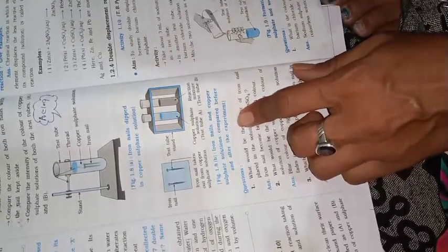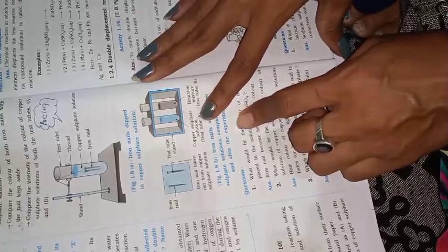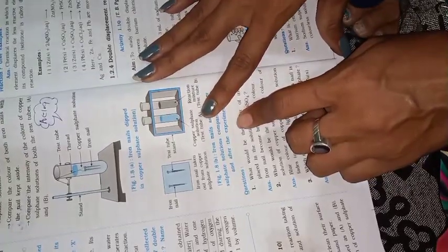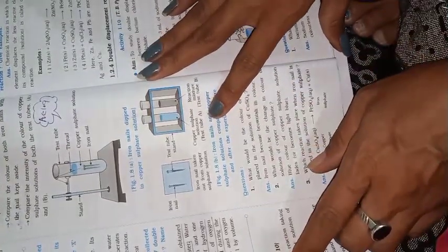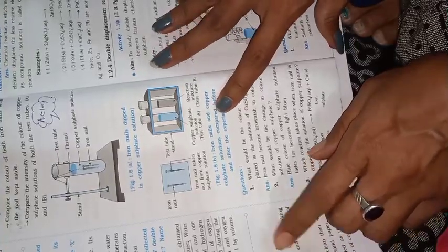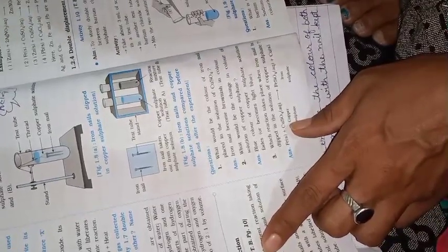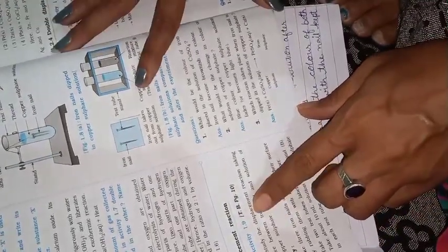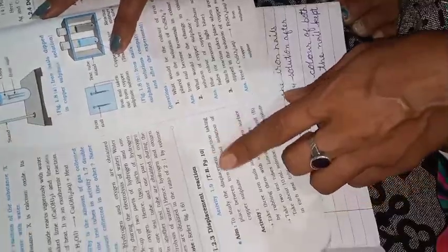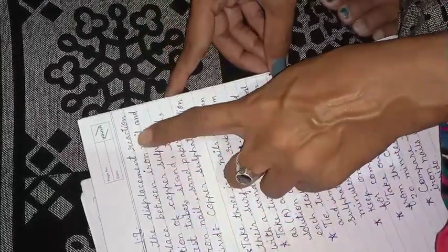Hello students, last time I taught you about activity 1.6 to activity 1.8. Today I am going to teach you about activity 1.9, 1.10 and 1.11. In activity 1.9 we are going to study the displacement reaction.